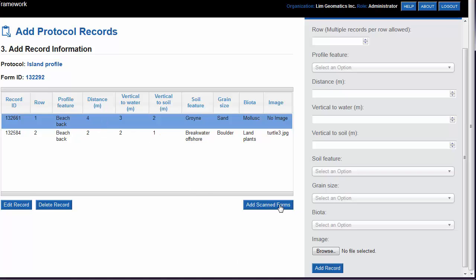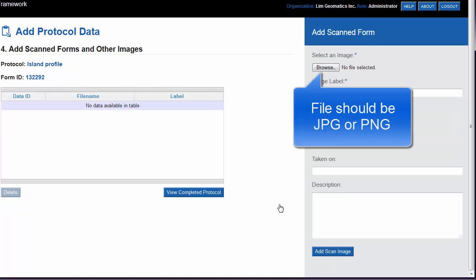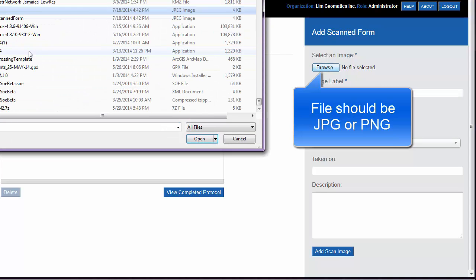When we're finished adding our records, we want to add our scanned forms by clicking on the Add Scan Forms button. The Add Scan Form panel will appear at the right-hand side. We select Browse to browse for the scanned form.